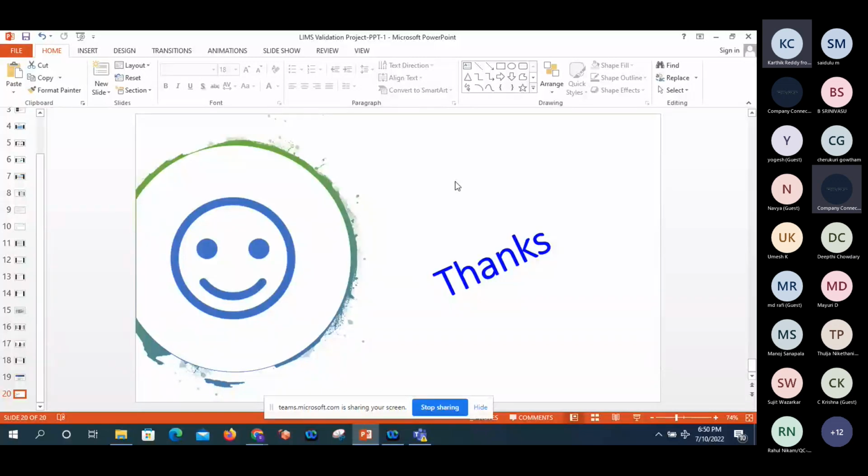Let us say there is raw lot management. Lot management has 5 types, like raw material, in process, finished goods, and so on. But in that, we will introduce one initially. We need to do the development testing in the development environment. According to the URS, whether it is intended for internal use or not, we need to test.